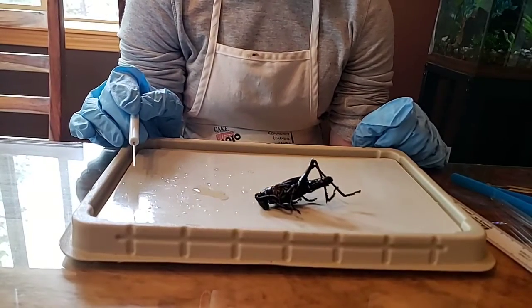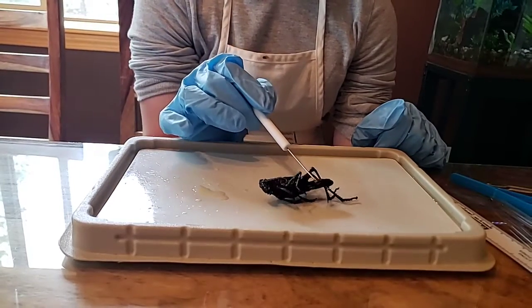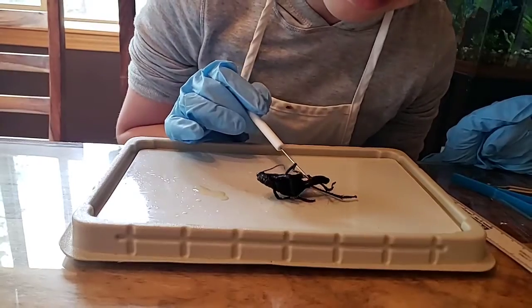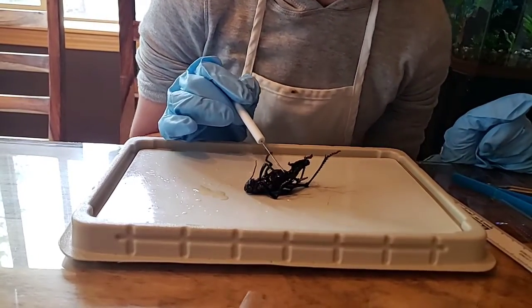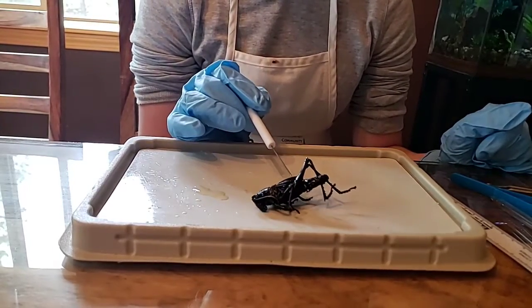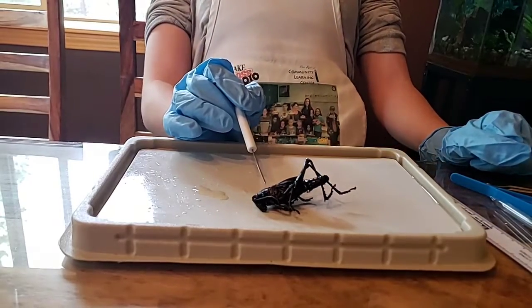All right, number 3. Observe the abdomen. Find the spiracles, tiny openings into the trachea. Trachea are a system of tubes that function in gas exchange. These breathing tubes extend through much of the body. Spiracles can also be seen in the thorax. Can you find the spiracles?